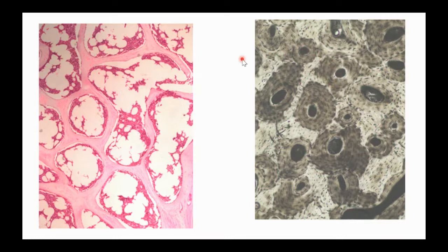So my osteocytes, my bone cells, surround these central canals in the tree rings to help us make this pattern where they'll actually share nutrients with each other. So when you're looking at compact bone tissue, everywhere on the slide is going to be filled with osteocytes. It's going to be filled with calcium, which in this case looks kind of light around here, and it's darker that I'm seeing closer to the blood vessel.